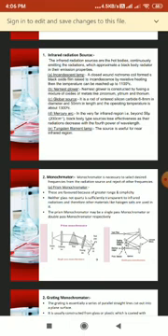The radiation source emits radiations of various frequencies, while the sample in infrared spectroscopy absorbs only at certain frequencies. It is therefore necessary to select desired frequencies from the radiation source and reject the radiations of other frequencies. This selection is achieved by means of a monochromator.